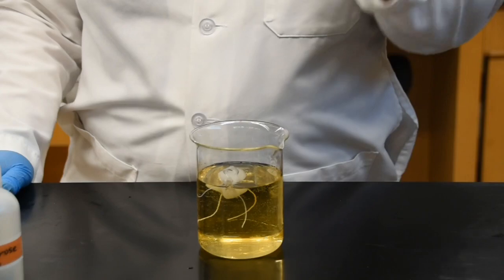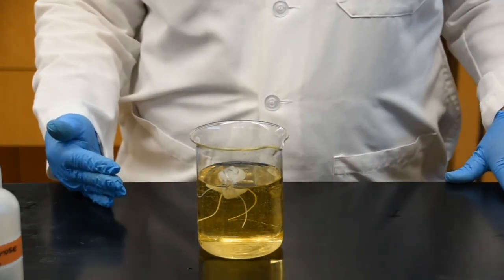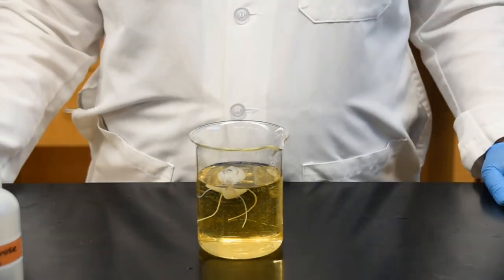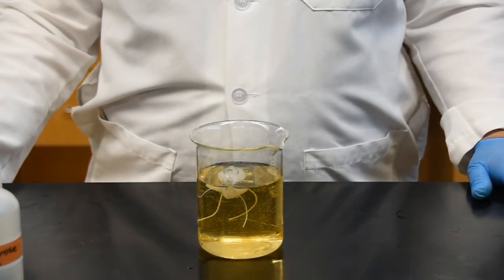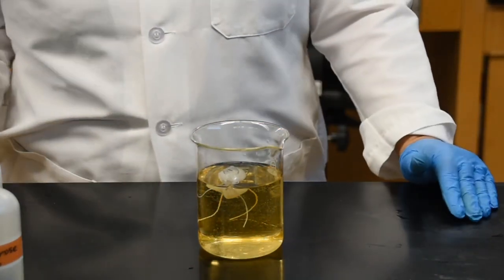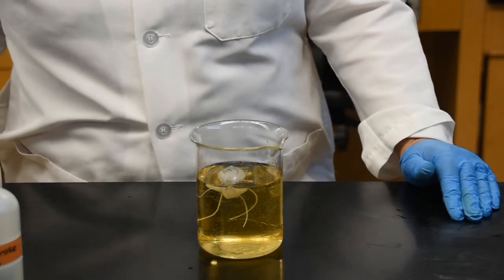What if the solution inside my baggie changed? Right now, if you recall, it was cloudiness that is associated with the starch solution. So let's say the color of my baggie changed to bluish black. In that scenario, it means iodine successfully passed through the cell membrane and was able to interact with my starch. If the color of the starch stays the same, that means the iodine did not pass through the membrane and therefore no color change was observed.